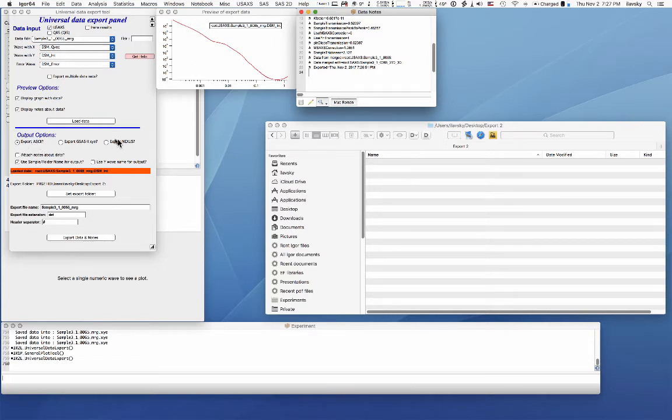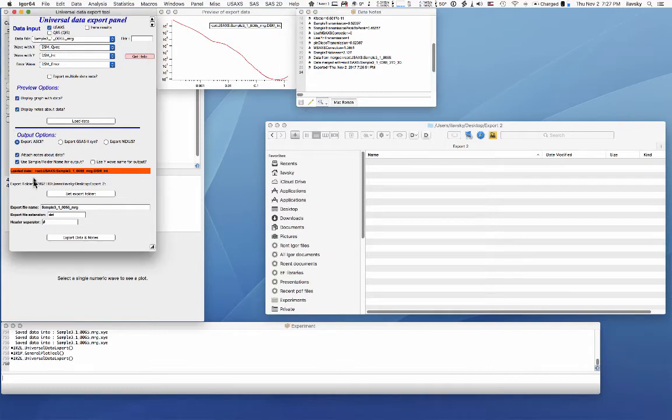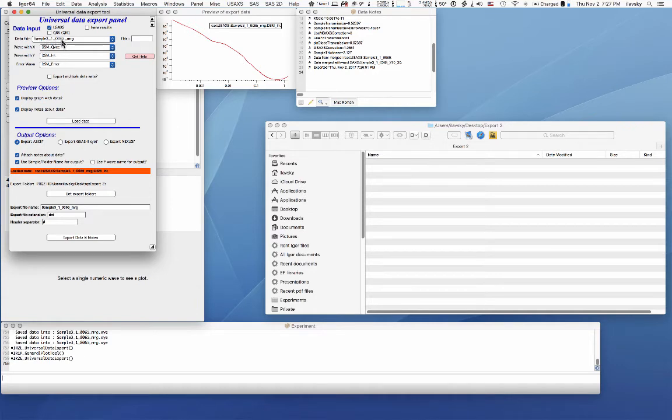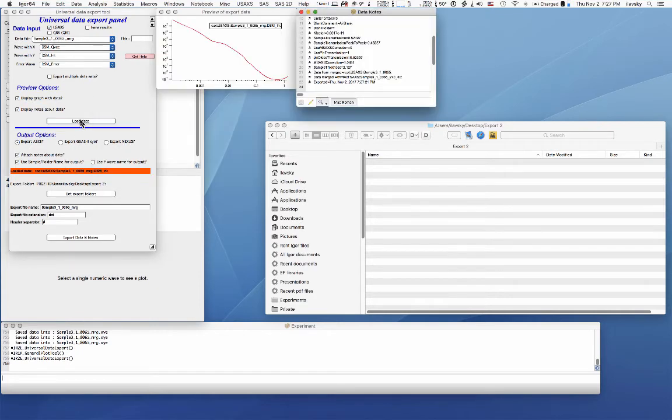Then for small angle scattering data, you really have two options, ASCII and Nexus. And I'll show you both of them. You can attach notes in there and typically using a sample/folder name for output, that's going to generate a file. It's going to have a sample three, one, blah blah blah here. So you can do it. You can reload the data and that will generate this name here.